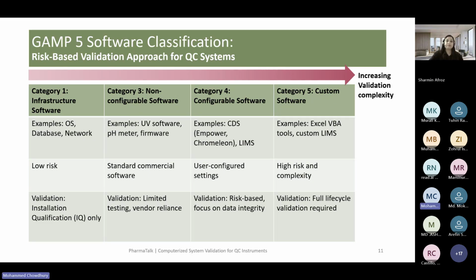What I saw in the guidelines is that they say we can rely on the vendors. If we want to rely on the vendors, we need to be confident in the vendors' quality management systems. Yes, and to be confident in the vendors' quality management system, we need to audit them. It is as simple as that.